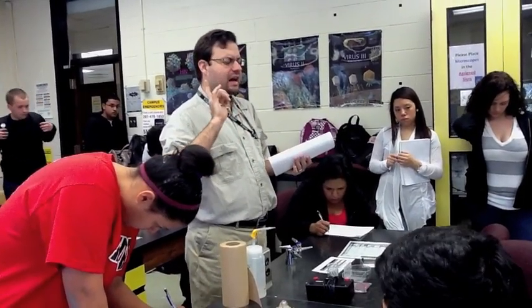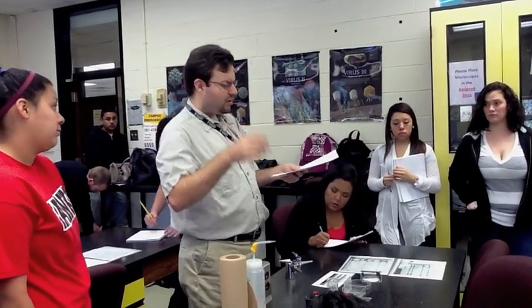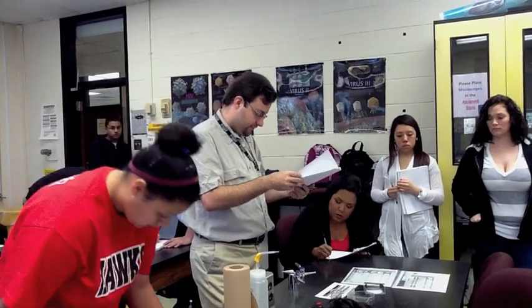The only other thing I'm not sure I told you: do you remember the liquid on top of the gel? That was called TBE buffer, and for some reason that always pops up on the test. The last thing you'll need to know is how the DNA strands are separated. It's done two ways: one by size and two by charge. Remember the example I gave of the semi and the motorcycle going down the congested highway.